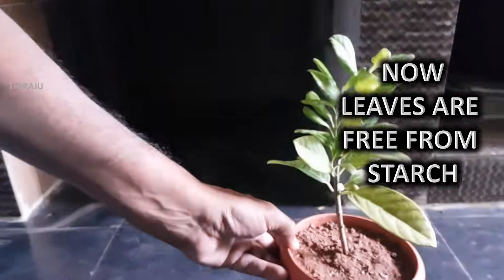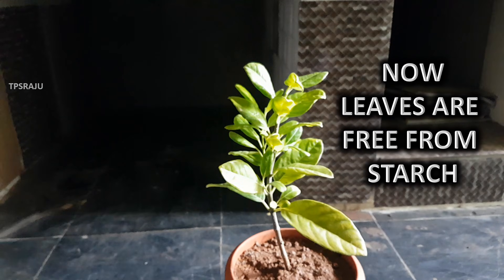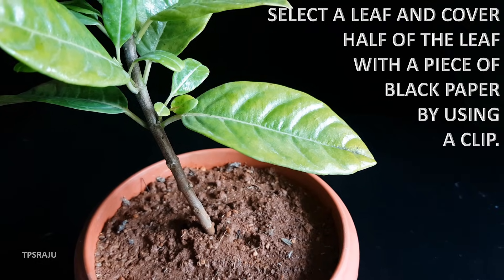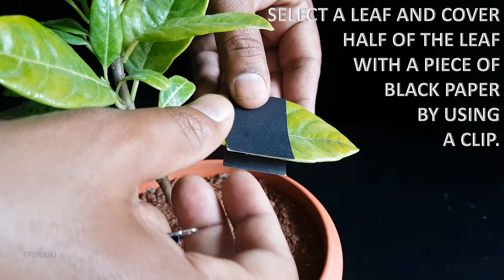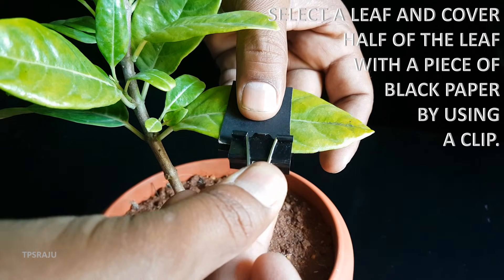Now, the leaves are free from starch. Then, select a leaf and cover half of the leaf with a piece of black paper by using a clip.